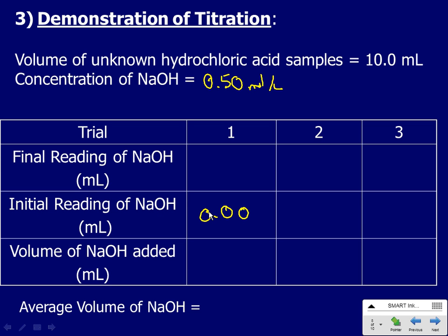All right, right from the jar. I need a dropper. Actually, I could use that water dropper. Okay, which one was I mixing? This one? If it is actually basic, which it should be because I'm way past 10, and my phenolphthalein was no good, then this should indicate base, which means we should get very purple. Oh, look at that. There's our purple. Yeah, the phenolphthalein was no good. That's a failed titration, by the way, folks. Phenolphthalein right there. The extra back.